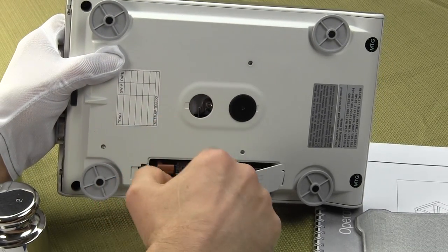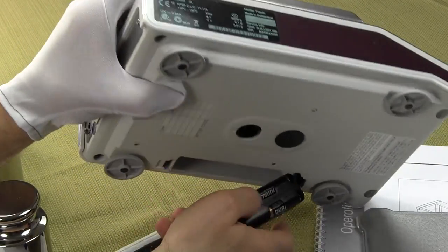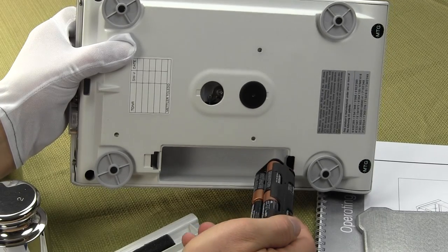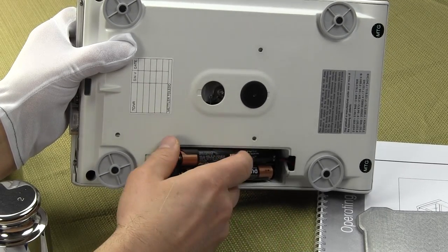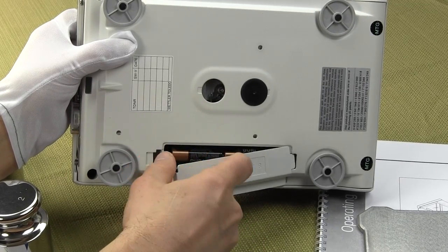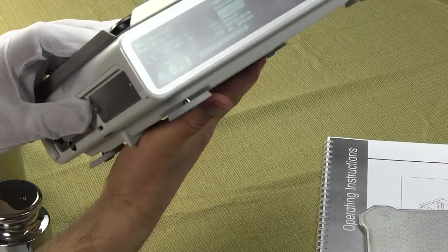Again, the total unique feature about this balance is you can operate these balances now off of battery power. You have here eight batteries in this pack. Really nice. So if you're at a jewelry show or something like that and power is not available, you can now operate the balance no problem.